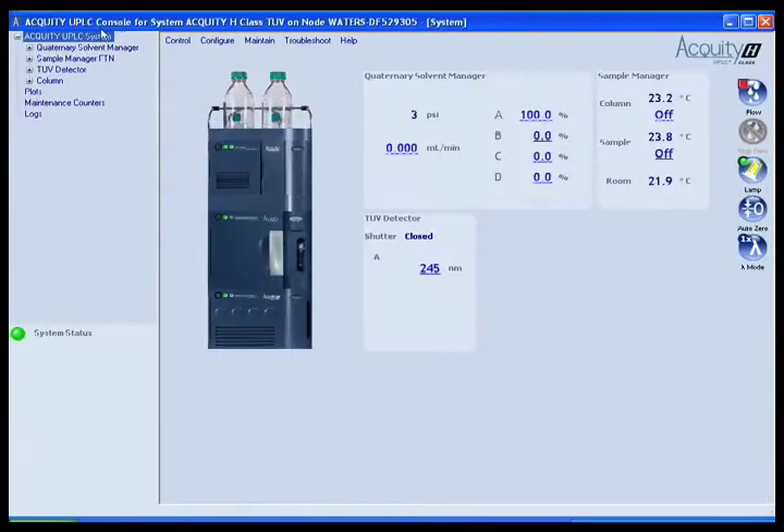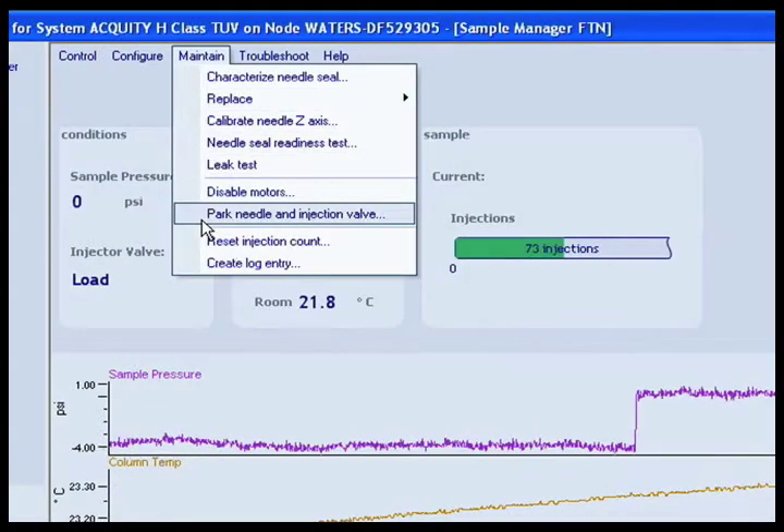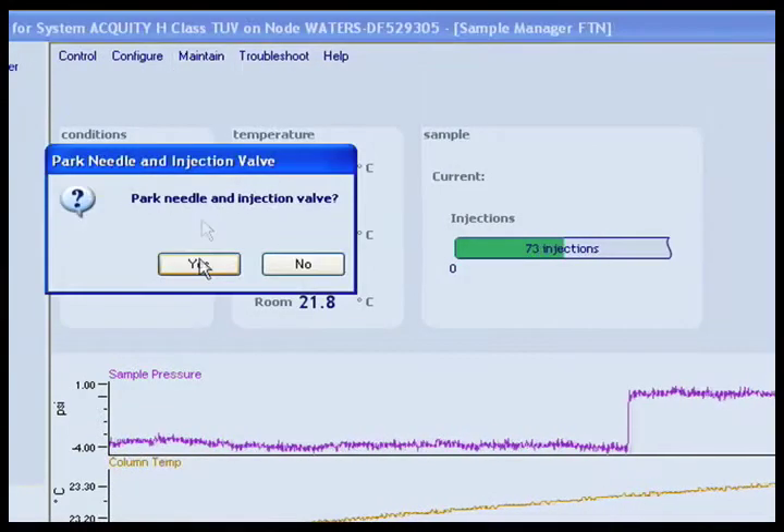In the console, select Sample Manager FTN from the system tree. From the menu bar, click Maintain, Park Needle and Inject Valve, Yes.